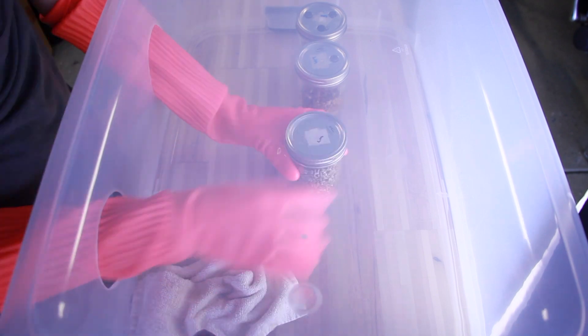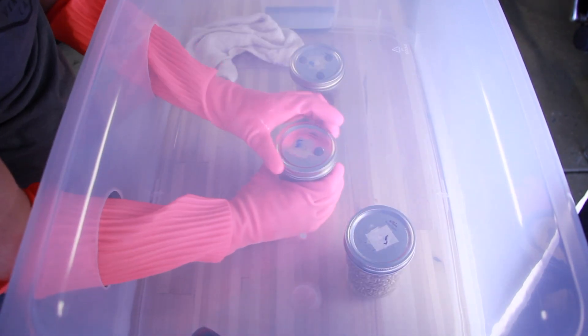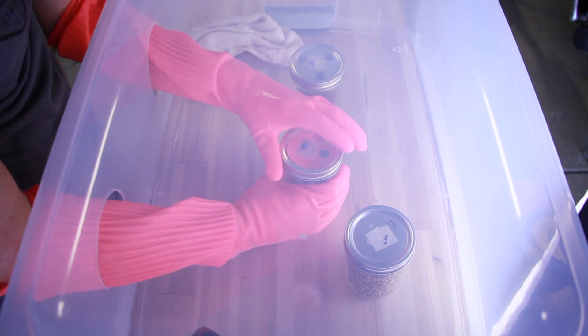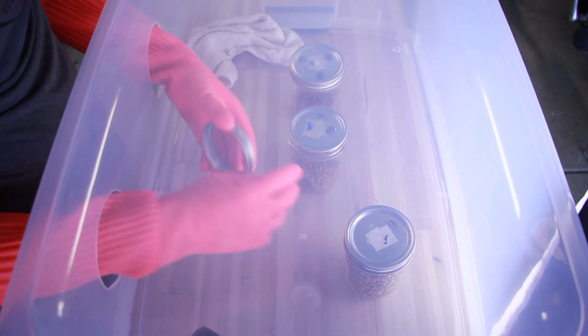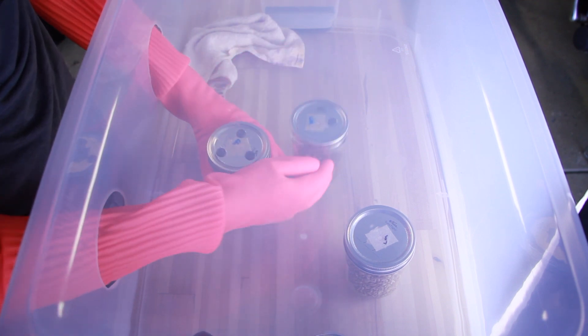I finally ran out of disposable gloves and I'm not going to buy any more - I'm just going to keep using these reusable gloves. It's kind of a waste to be throwing gloves away every time, so these reusable gloves should work out fine. I spun the rings off and left the lids in place - this should make it pretty easy for me to uncover and recover when I go to pour in my colonized grain.